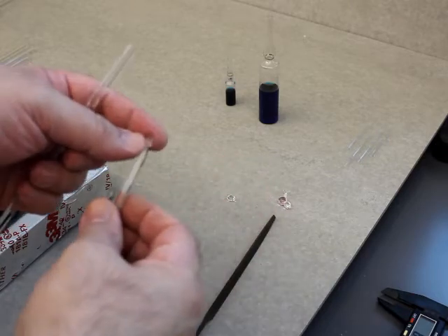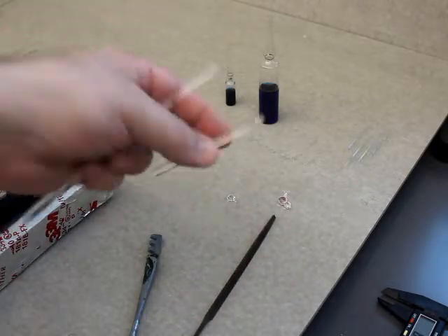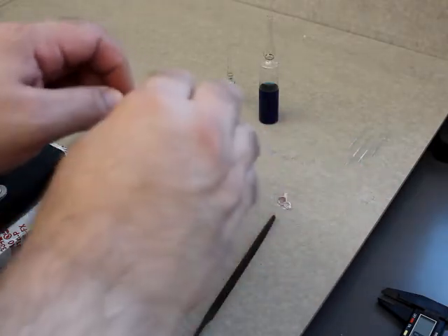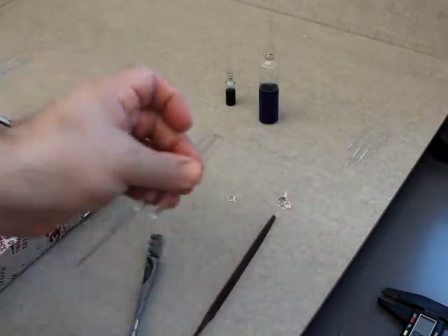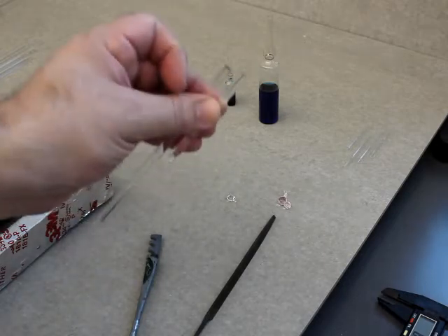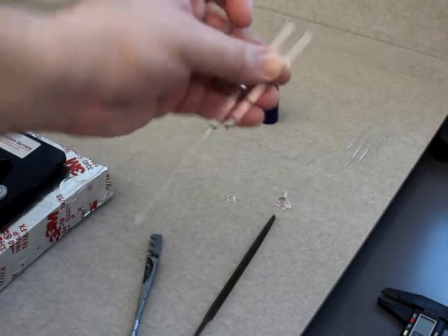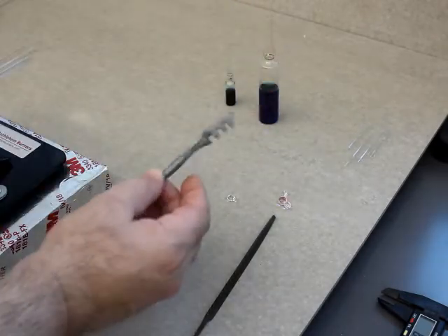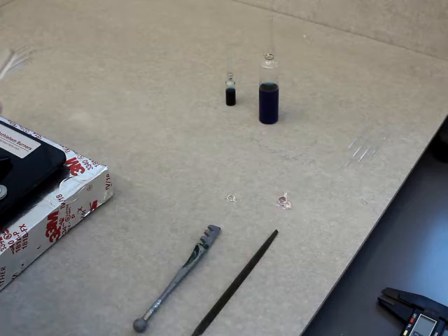I wasn't expecting that to break. I wasn't concerned about it because my hand wasn't touching it. But again, that's something you want to keep in mind: when you pop it, it should just take a tiny amount of energy when you break the glass. Right now the edges are razor sharp, so if I was going to use this I would need to fire polish it. But again, this was from the waste jar — just to show the technique of using the glass cutter for scoring and snapping, just like the triangle file.